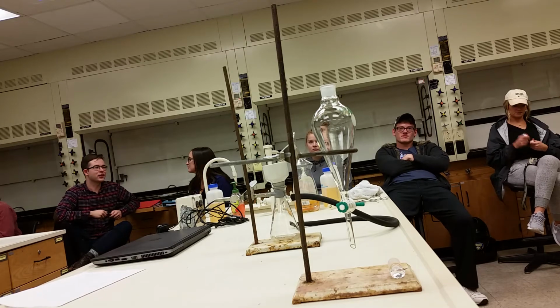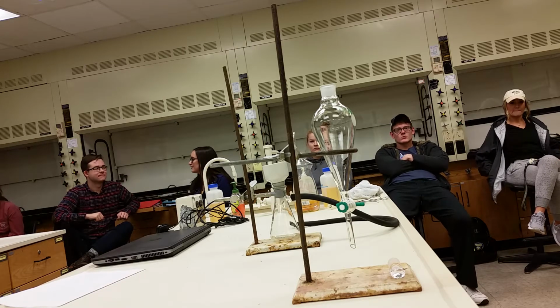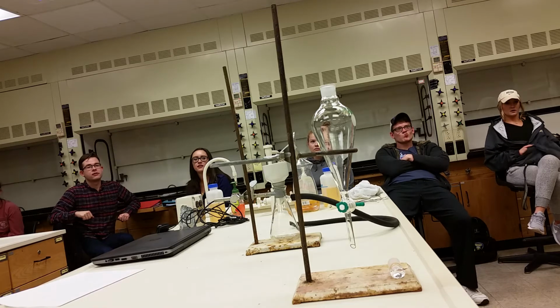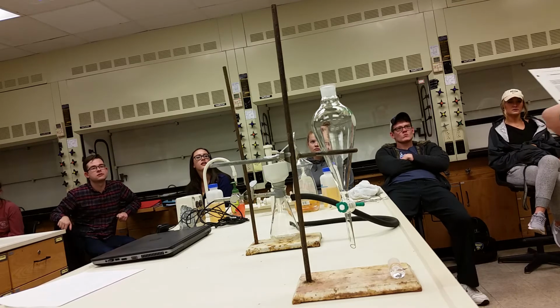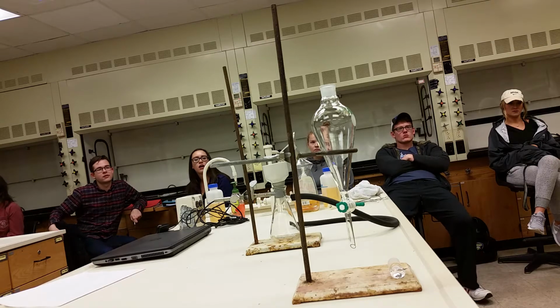All right, so we're going to run separation of an unknown mixture by acid-base extraction. So you got a pre-lab assignment. Look up the melting points of all potential unknown compounds and fill the scheme on the report sheet.